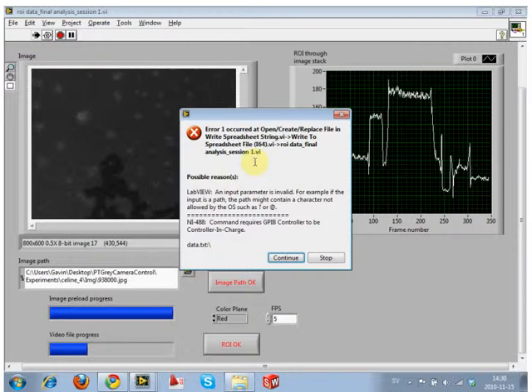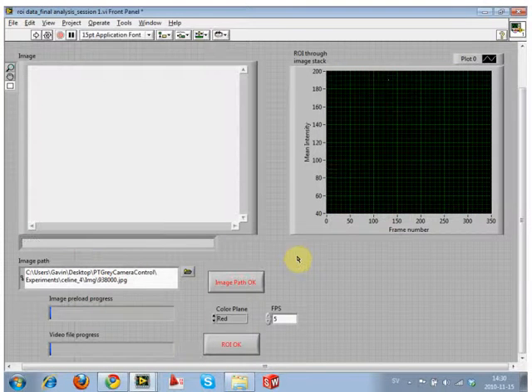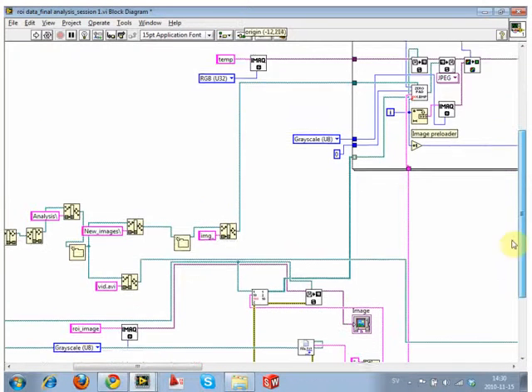But why, at the beginning when you run and you see just this part transparent, when we didn't know where the error was and it was running, it was transparent only there. The first time you ran it and it didn't work, you just saw that it was transparent here, right? Yeah, it's because it was stuck.